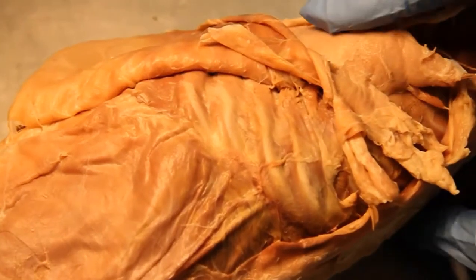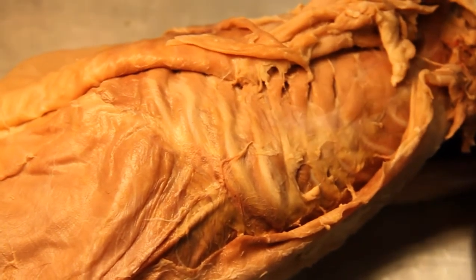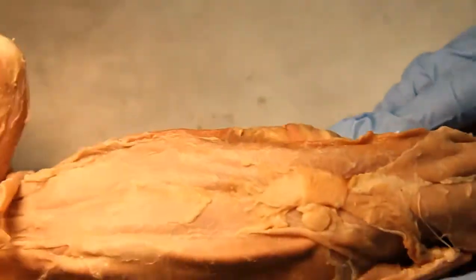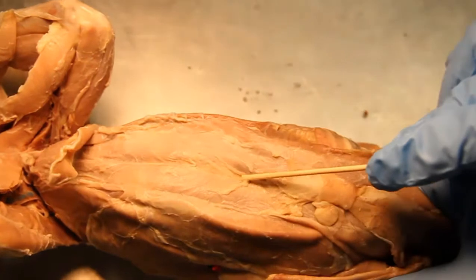And then what about the intercostals? The exterior intercostals. And the ribs. Right here we've got the rectus abdominis, and then in between that we've got the linea alba.